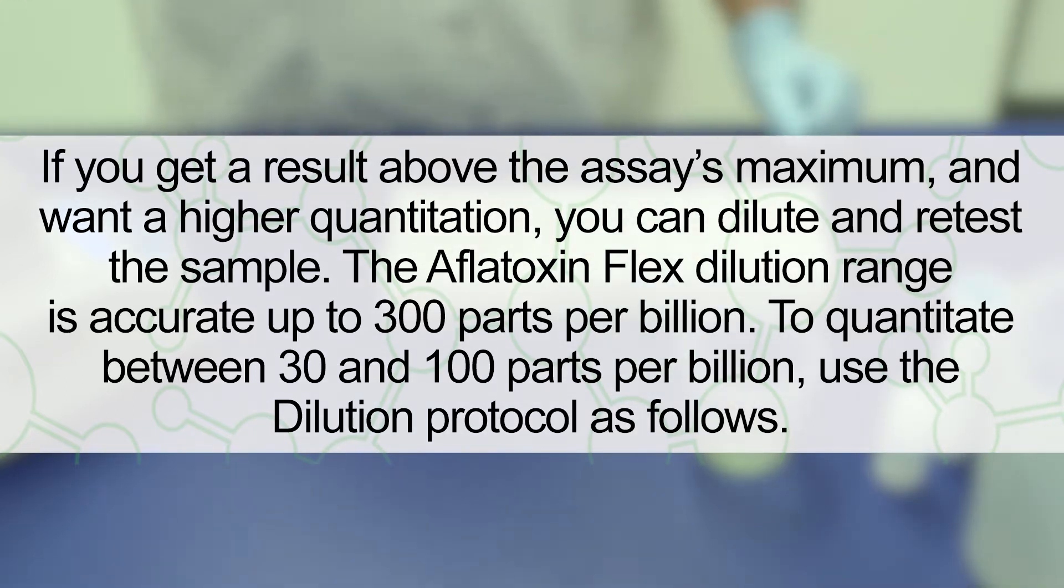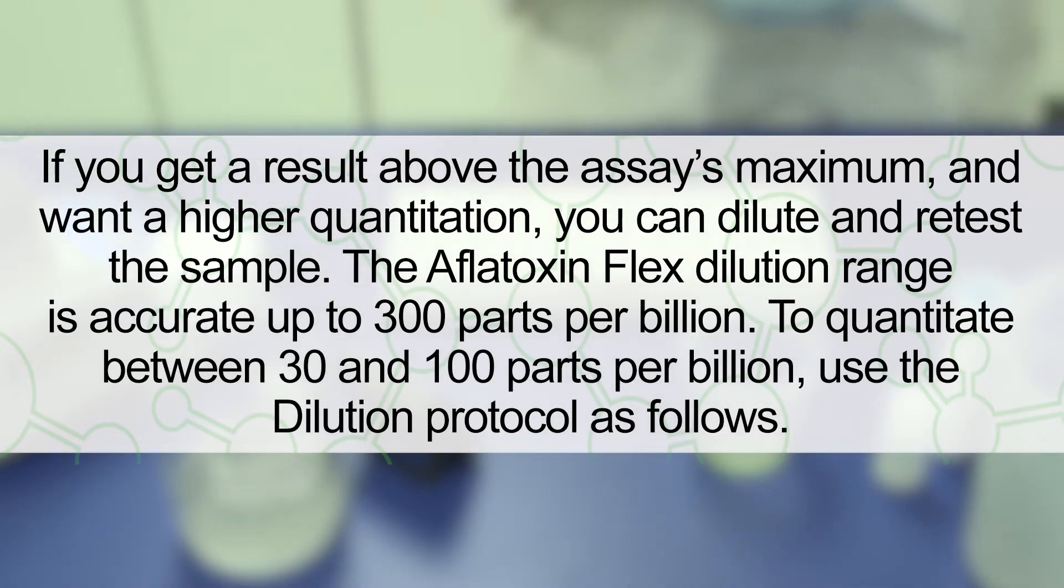To quantitate between 30 and 100 parts per billion, use the dilution protocol as outlined in the product insert for the specific matrix. In this video, we are diluting a corn sample.